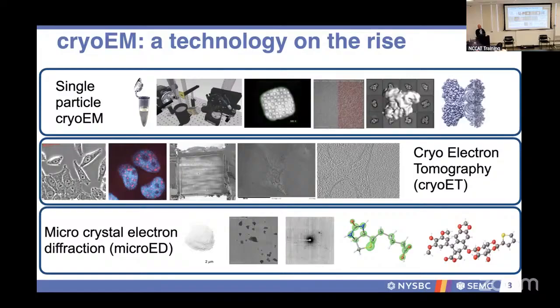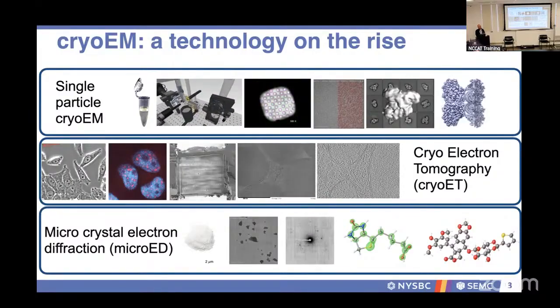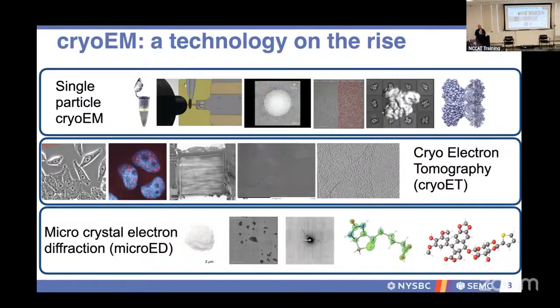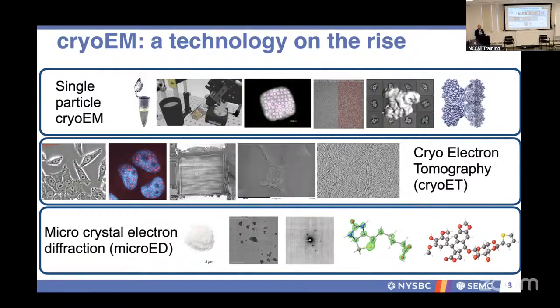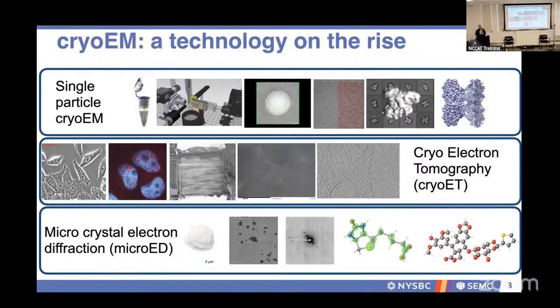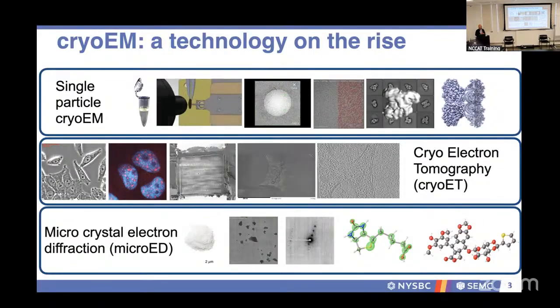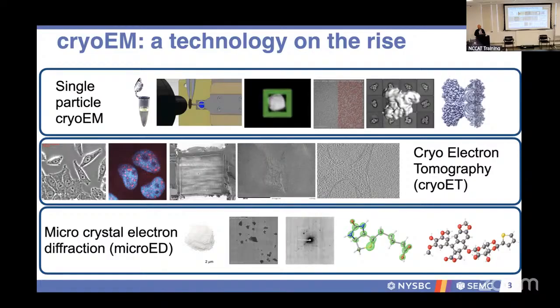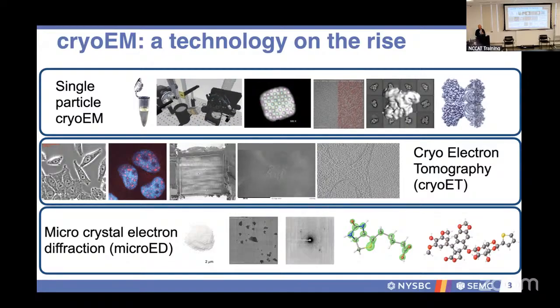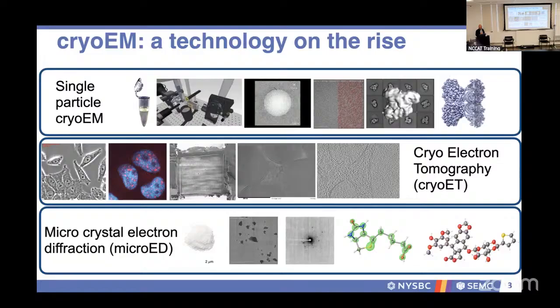In terms of cryoEM, I just want to reiterate what we heard a little bit earlier in the morning. We tend to be quite imprecise in terms of the nomenclature as well as the vocabulary we use. And that's due to the fact that the group of cryoEM technologists was very small. And when we were using shorthand, we knew we were using terms imprecisely, and that was okay. As cryoEM has expanded, it caused some confusion. Joachim highlighted Coulomb potential maps instead of density maps, we know, and resolution, things like that.